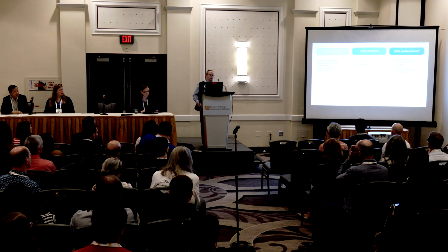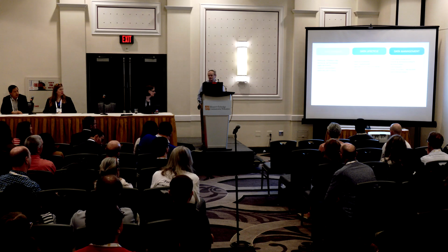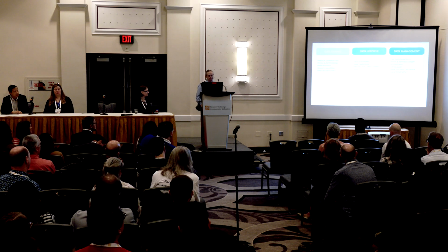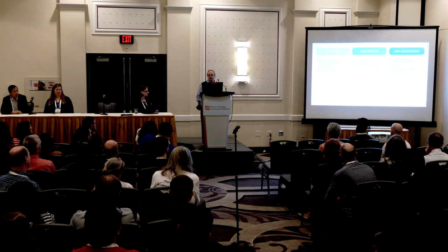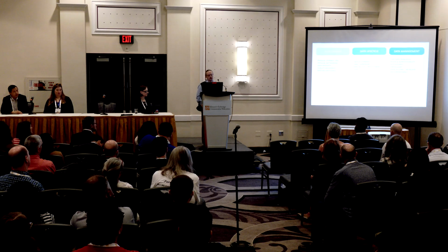I'm just going to begin very quickly. What do I mean by data management? I want to put some definitions out there. Other people on the panel may have different definitions, but this is what I use. There are kind of 3 levels that I think about this on. First is data storage. There's a lot of challenges associated with data storage. These are questions like what physical storage is, networking, data integrity, quality assurance, data security levels so that you're not stealing somebody's social security numbers.